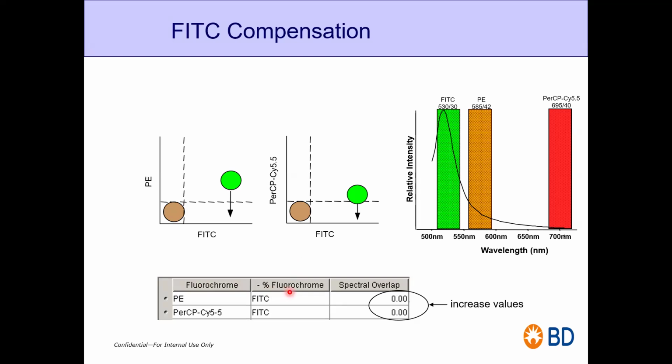You can write it down tomorrow. I'm going to ask you this, and we are going to do the compensation tomorrow live in the machine. So there is this formula called percent unwanted minus percent wanted. You have to give the value here, so it will do the compensation. Basically, it's removing the unwanted signal from your wanted signal.